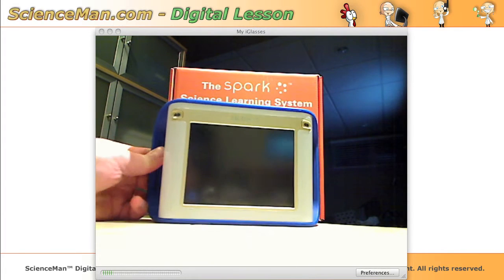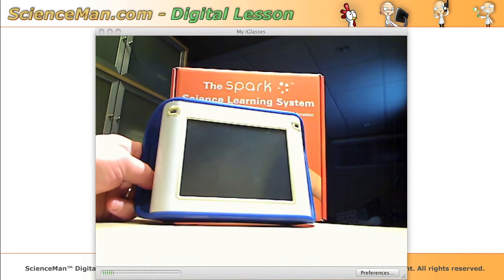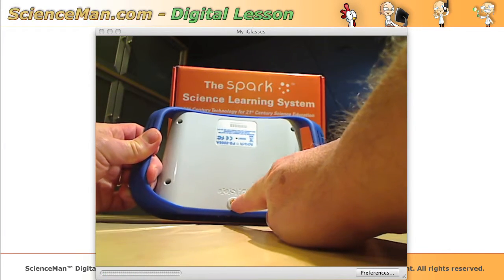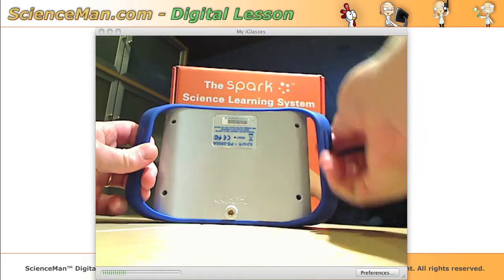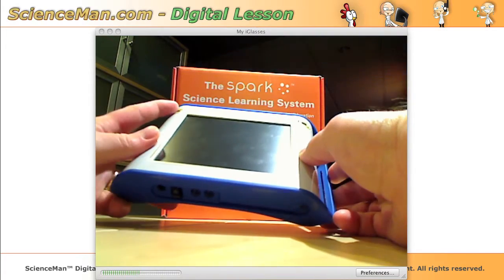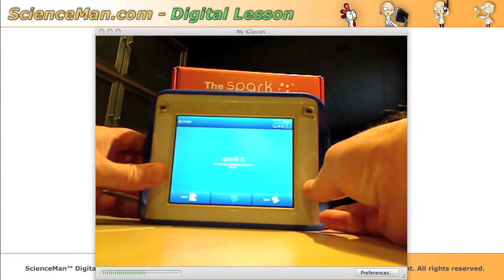The first thing that strikes you about this unit is its very rugged design. It's got a strong plastic shell on the back, and it even has a mounting hole for mounting to rods and lab stands. I wouldn't have any problem at all giving this unit to a junior high student — it's built to be indestructible.